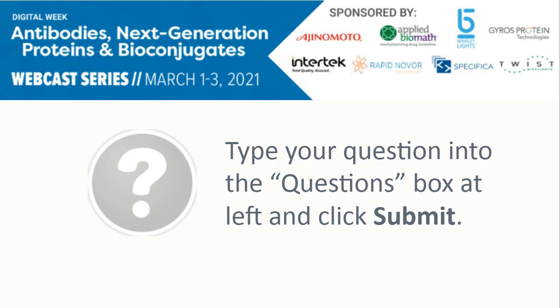Okay, great. Thanks. Next question. How much antigen needs to be provided for immunization? Yep, good question. So we look for a few mgs. That exact amount will just depend on the nature of the antigen, like whether we're talking about a peptide or a soluble protein or what the case may be. But generally, that's how much we look for. I'm happy to talk about that offline as well. We can definitely have a specific conversation about that.